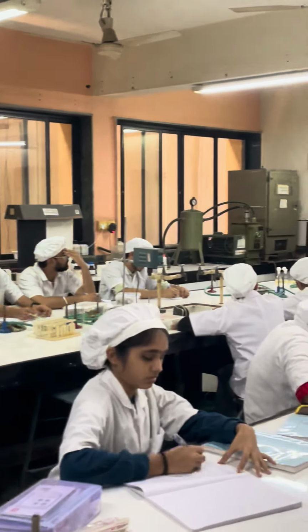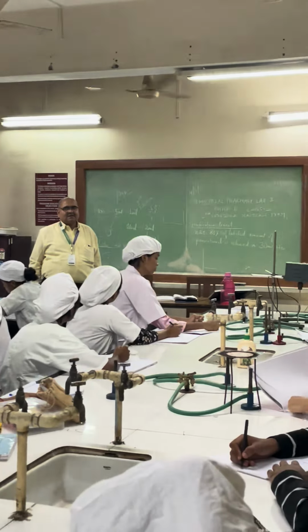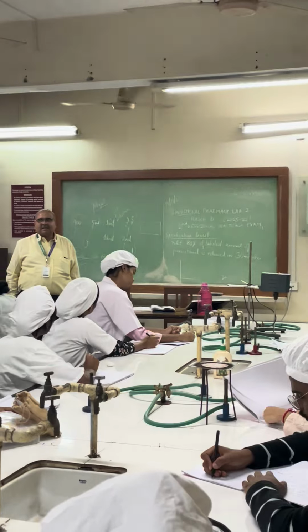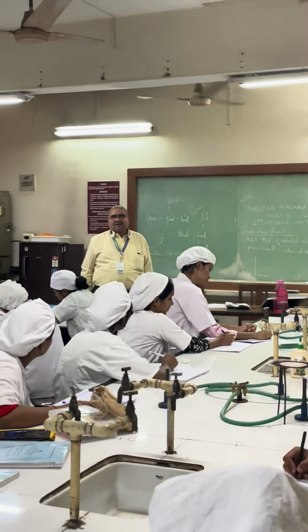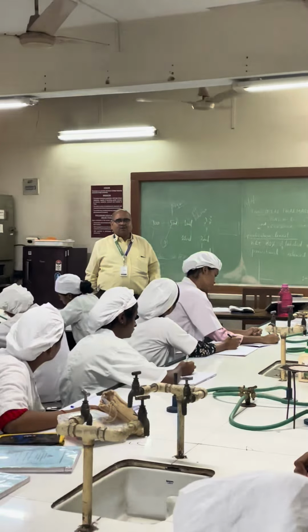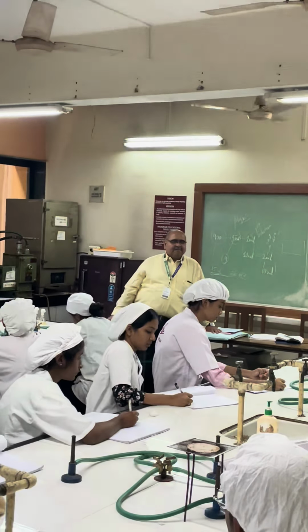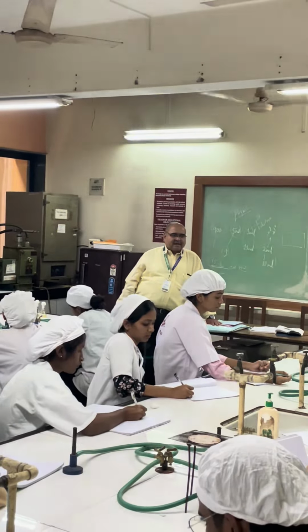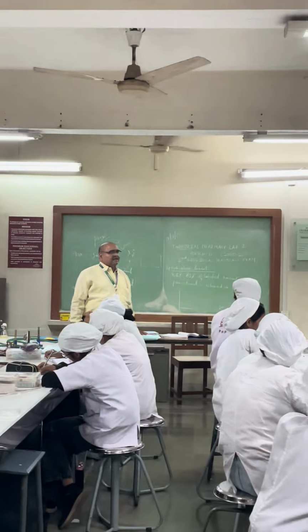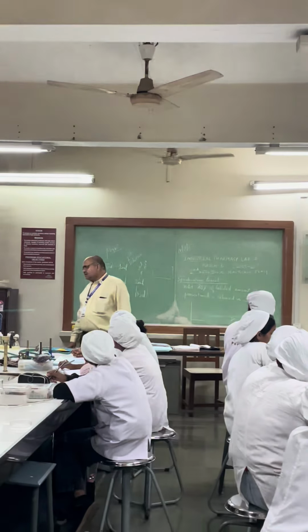performed using 3 test tubes of double strength lactose fermentation broth, 3 test tubes of single strength lactose fermentation broth, and 3 test tubes of another single strength lactose fermentation broth, 3 rows. If the MPN is high, the water is non-potable. If the MPN is 0, then water is potable. To detect this, in today's practical, you are going to use 2 different types of waters.